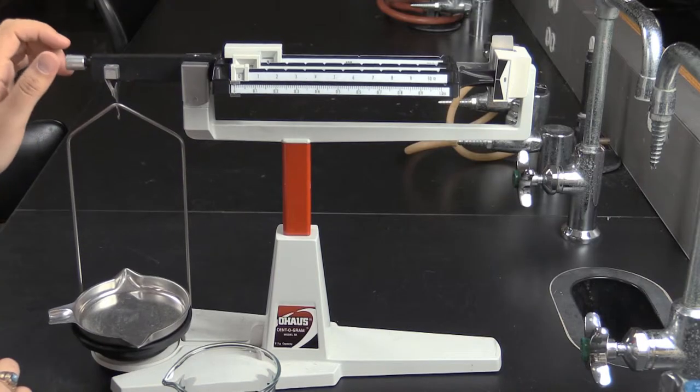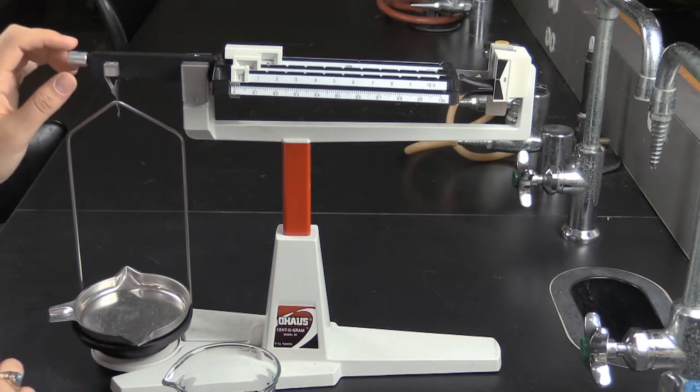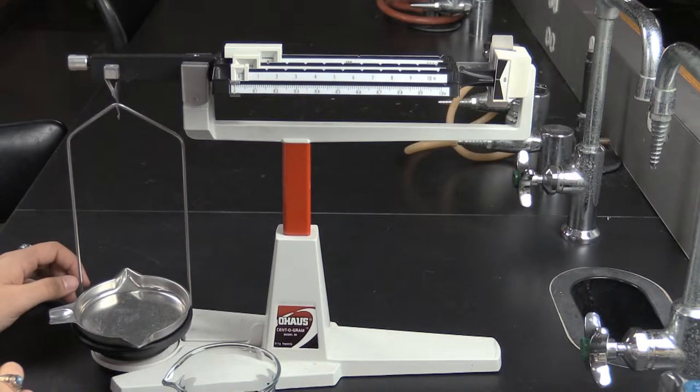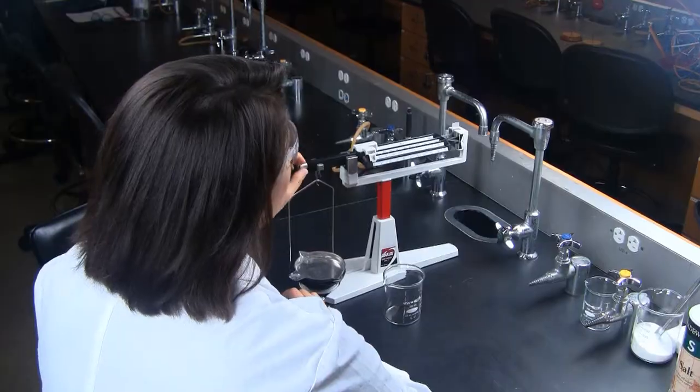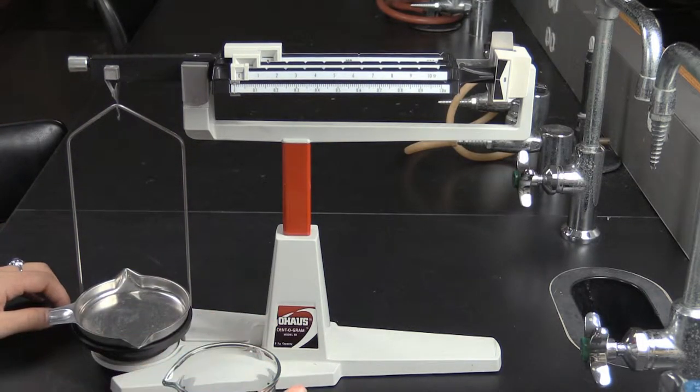This will take a bit of back and forth until you get it just right. To adjust the beam side up, loosen the nut, turn counter-clockwise. Righty tighty, lefty loosey. To adjust down, turn it in the opposite direction.